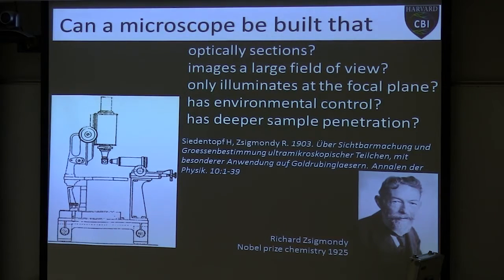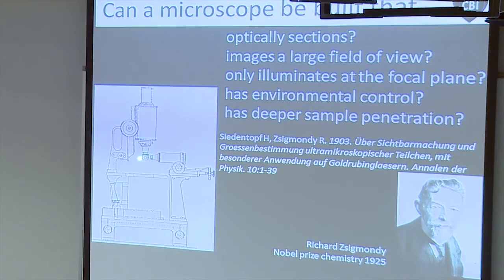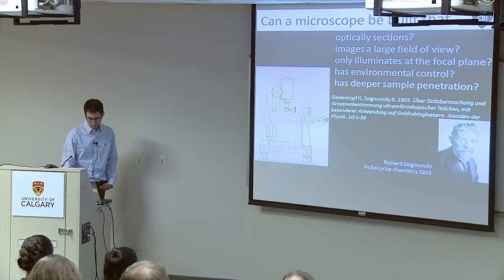So Zsigmondy designed this microscope where he had a little cuvette here that sat with his gold colloids on it, with the standard microscope imaging axis that everyone's used to. But then he came in with a second lens group here on the side that focused excitation light. He had a light source over here into his colloids. Right? So the design has been around for many, many years.